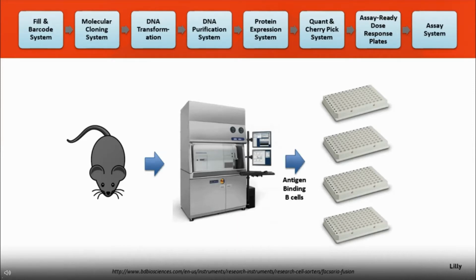And so we typically start with roughly 20 96 well plates. So the process I'm going to talk about here, usually it's about 20 96 well plates, so about 2,000 single B cells will go into this process as this first pass. There's several projects where we go through multiple passes, several immunization strategies, and so they grow significantly larger in size.